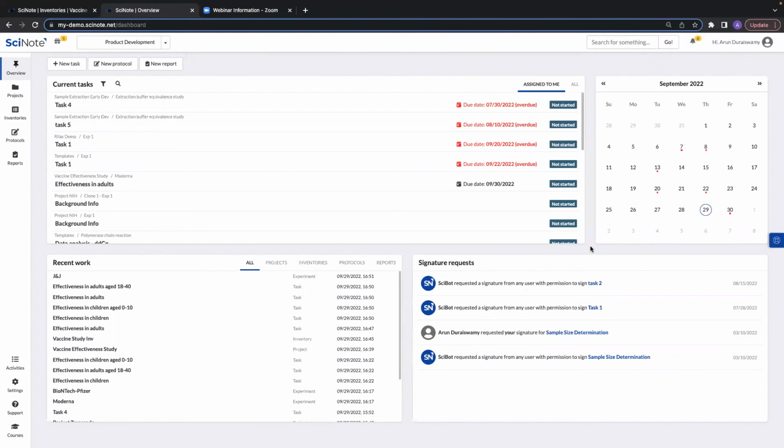We do have a few questions here. I'm going to start off with the first one that we got that says, are inventory item numbers unique in the complete environment? For example, the whole organization, independently of which inventories they belong to or which team owns or creates them. This is especially important if an inventory is shared between the teams, not to have redundant item numbers.